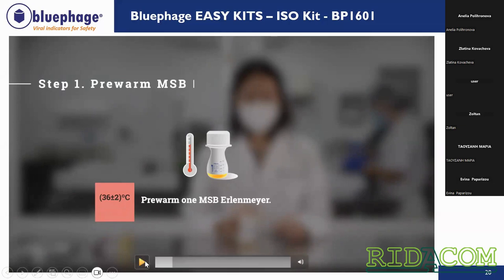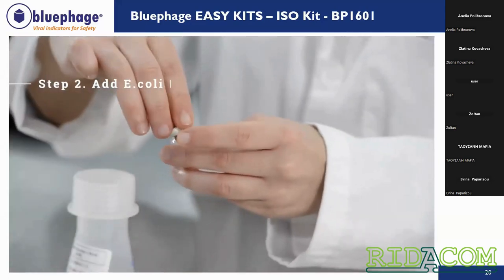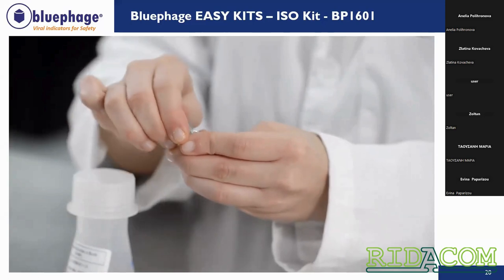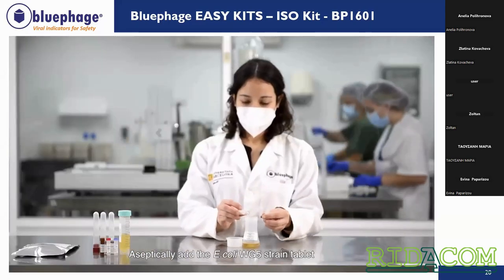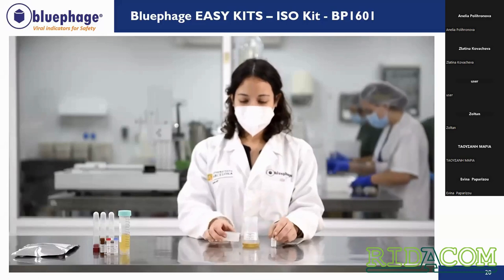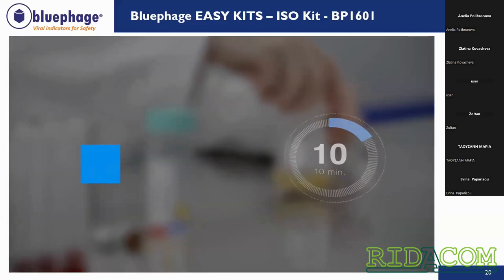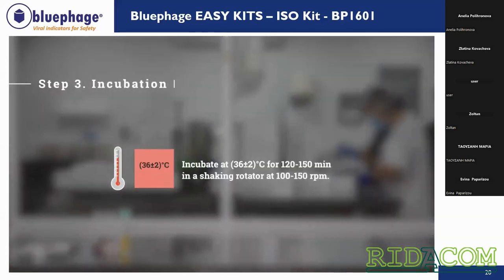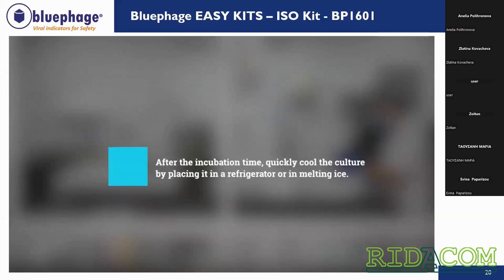The first thing that we need to do is to prepare the inoculum culture. In order to prepare it, we need to pre-warm the MSB Erlenmeyer. Once the MSB Erlenmeyer has been pre-warmed, we add our tablet of lyophilized E. coli WG5 inside the Erlenmeyer. We allow 10 minutes for resuspension or rehydration, and we put it in the incubator for 2 hours, 2 hours and a half, with a shaking rotator, or instead of a shaking rotator, shaking manually every 20, 30 minutes. That is really important.